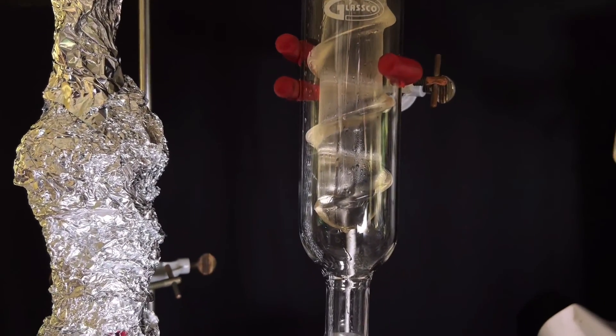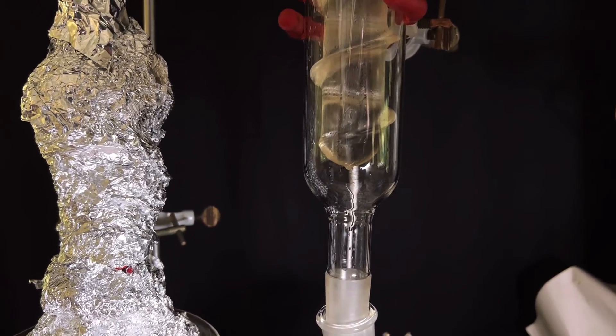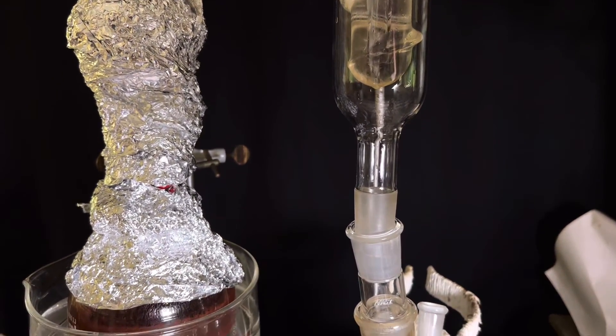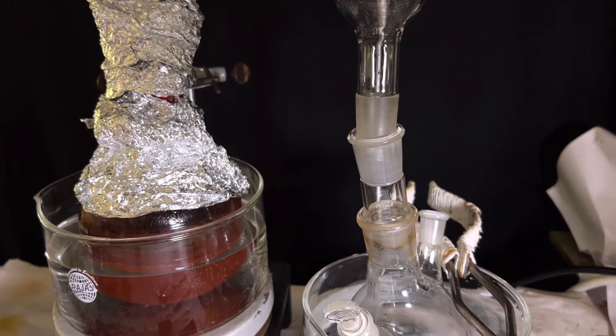When the water bath is gently heated, methyl iodide quickly makes it over and drips down the condenser column. You can clearly see that the temperature has reached 42 degrees C.